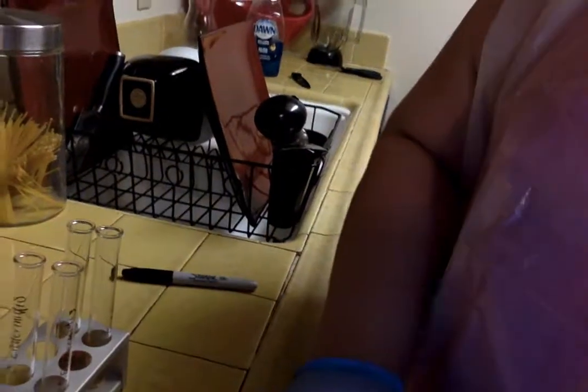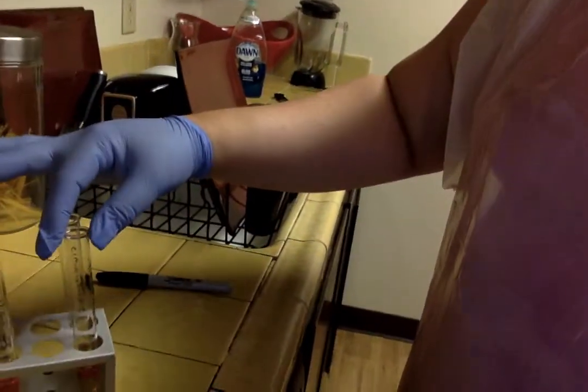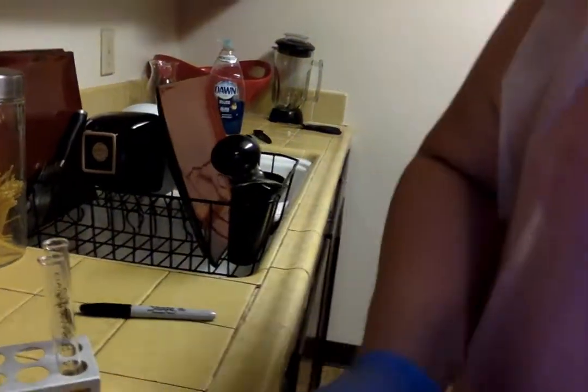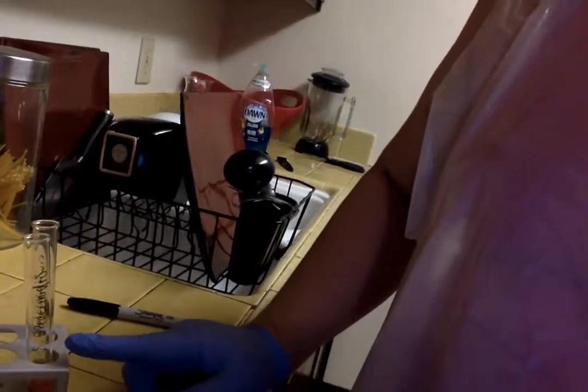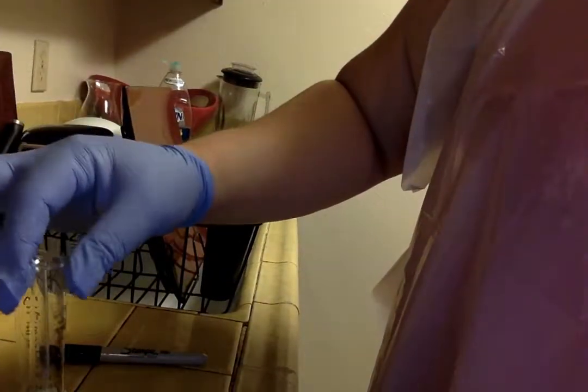And then the actual results here. So the first test, the methyl red test. Here is my first one, the Staphylococcus epidermidis. And the results for that one. It's been sitting for a little bit, but you can see it's mostly yellow versus the red. And for the E. coli, it's mostly red.